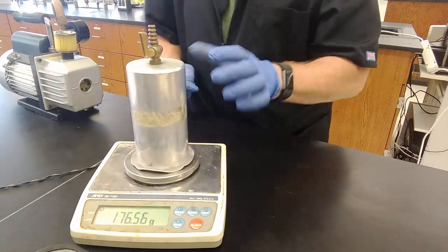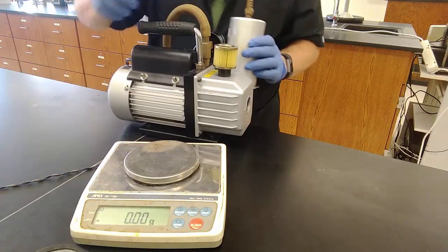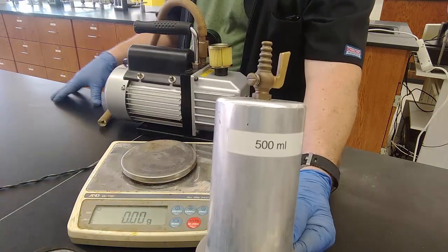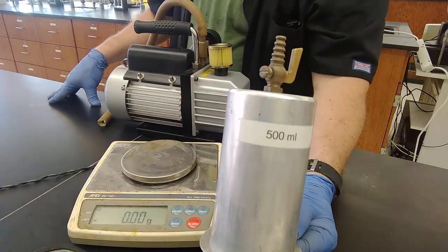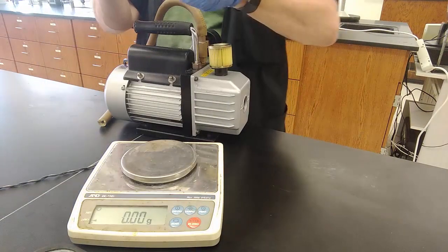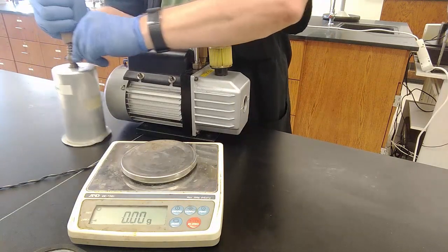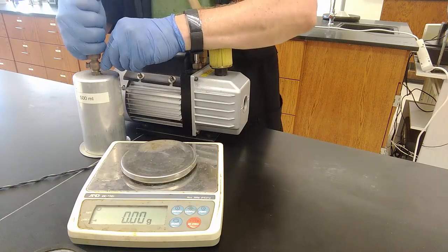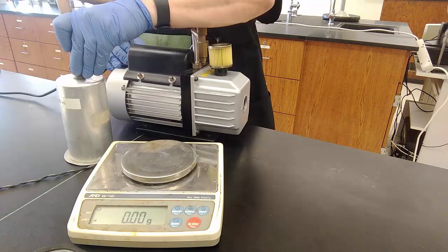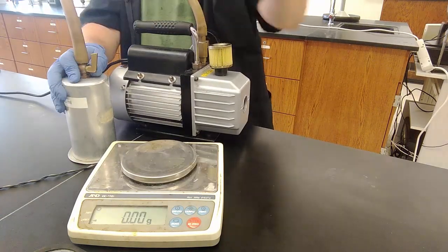Read your instructions. Open the valve and hook it up to our vacuum pump, and we will get all of the air out of our densitometer. 500 milliliters, 0.500 liters. So the valve is open so that we can suck the air out. Put on the hose. It's going to be a little bit noisy. Hopefully the noise control will catch it. Notice I'm hanging onto the densitometer so it doesn't flip over. There we go.